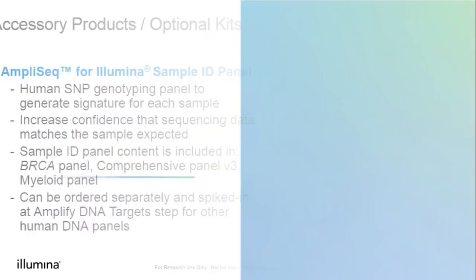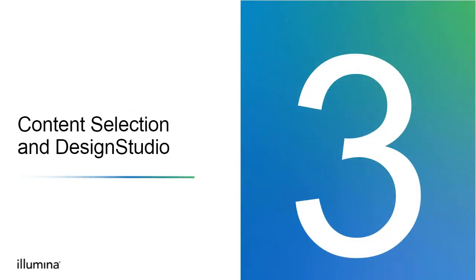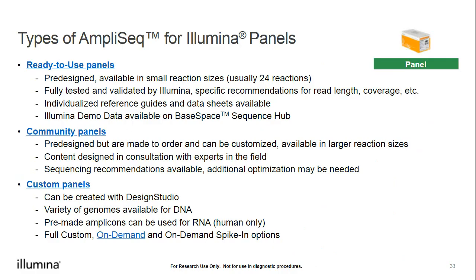So now that we know how to execute the assay, let's discuss how to select the desired content for your project. If you want to target custom content, you can use our Design Studio software. Before embarking on designing a custom panel, you may want to first check and see if there is a ready-to-use or pre-designed community panel that might already have what you need. As a reminder, here are the 3 types of AmpliSeq for Illumina panels I briefly displayed earlier. The AmpliSeq for Illumina ready-to-use panels are pre-designed, synthesized panels that are available in small reaction sizes, usually 24 reactions.